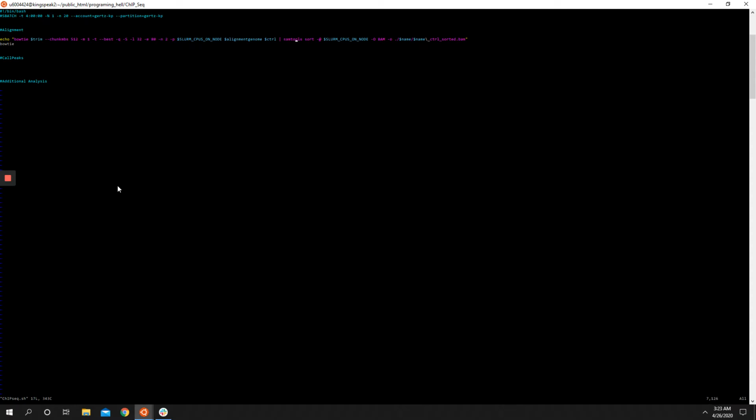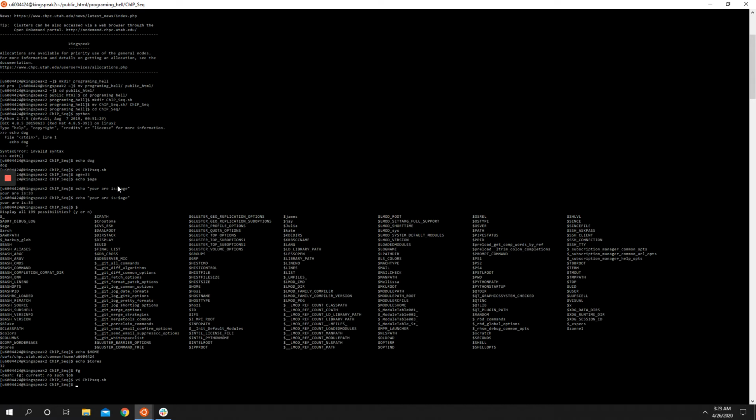And you can check if a variable is set with a quick test. You just say if double square bracket, space, make sure there's a space when you do these if statements. If, and then you can put in your variable name, age, semicolon, then echo true, else echo false, don't capitalize echo.